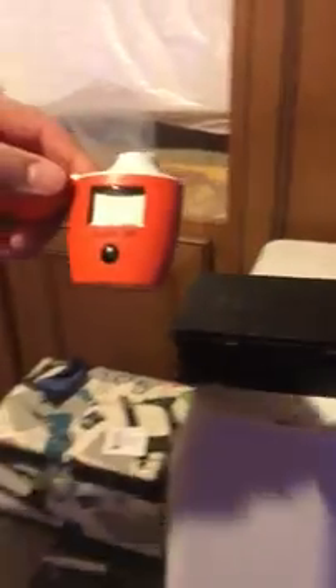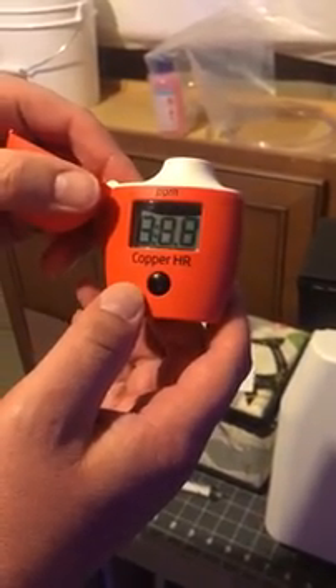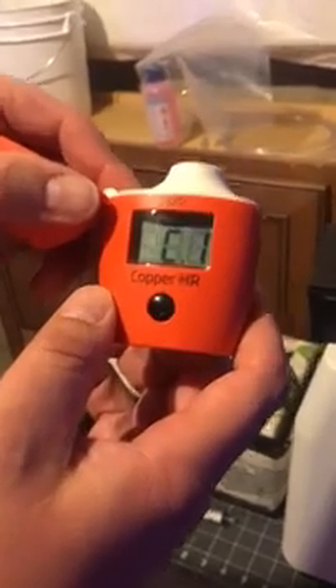We're getting all the excess in there; we're going to let that mix for a minute. Here's the infamous checker. So the way this tester works is you first turn it on with a single click, and my basement lighting is poor, so once you get the press button flashing for C1, that's when you are able to fill up the cuvette with your test water.